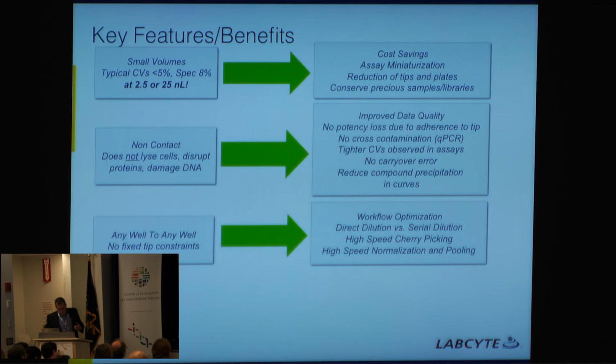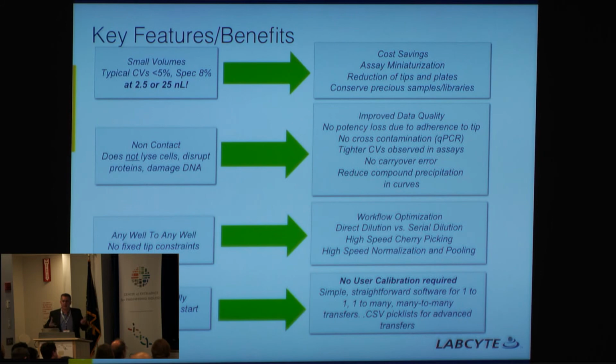And most importantly, even though the Echo is used on expensive automated high throughput platforms, DNA foundries, I think it's fairly end user friendly. And I think I can teach the average person to set up an Echo transfer and drag and drop their liquids around in about 30 to 40 minutes.